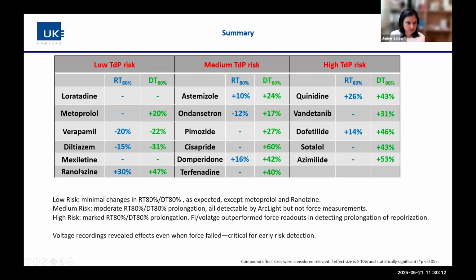And then ranolazine has shown this increase because it is a known hERG blocker and also a sodium channel blocker. So therefore, there is an increase in relaxation time and decay time due to its hERG blocking effect.